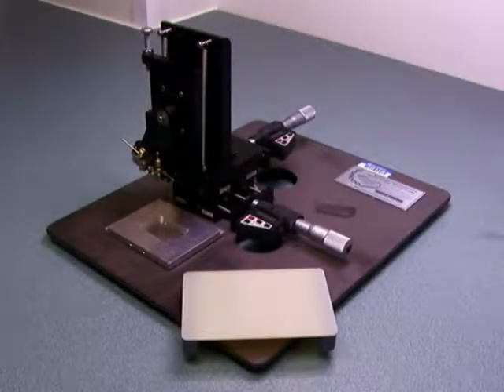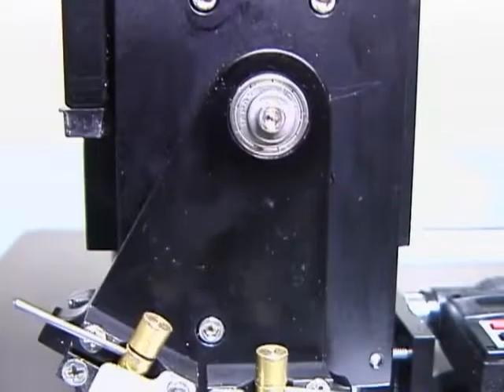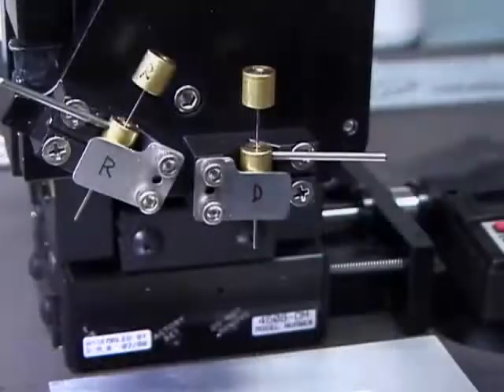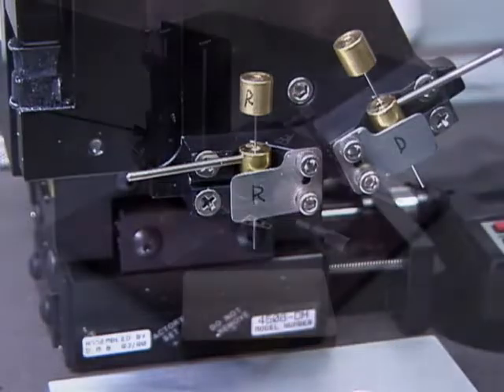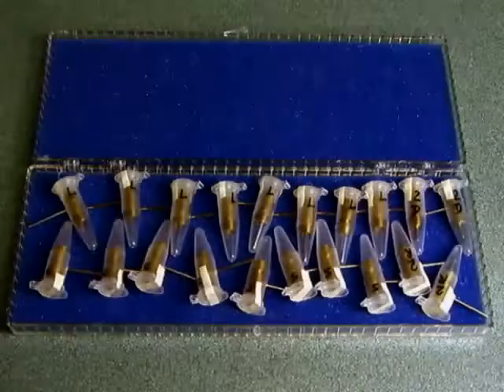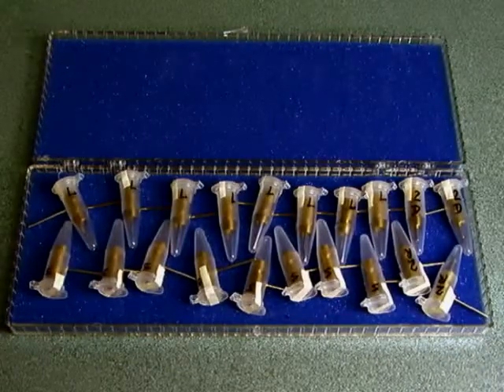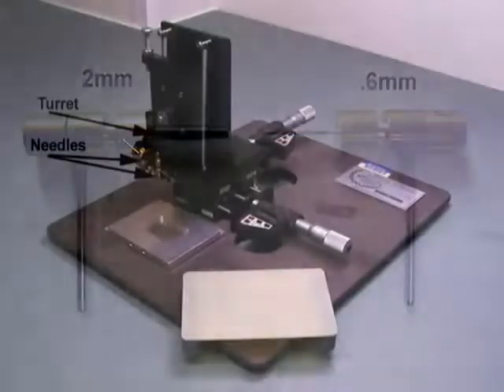The arrayer from Beecher Instruments consists of a turret, which is used for both punching and switching between the two needles. A pair or set of needles, one for punching the recipient or array block and the other for punching the donor blocks. There are two size needles available from Beecher Instruments, the 2 millimeter and the 0.6 millimeter needles. A 1 millimeter and a 1.5 millimeter needle is also available from Beecher Instruments.